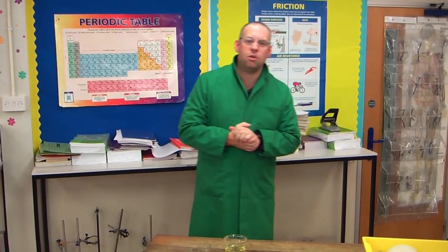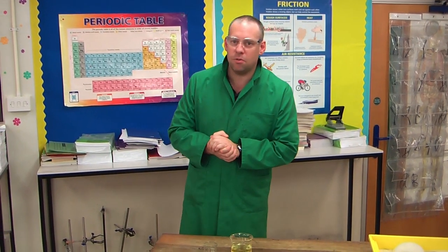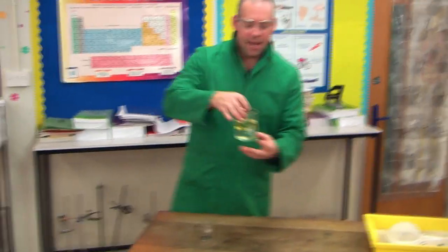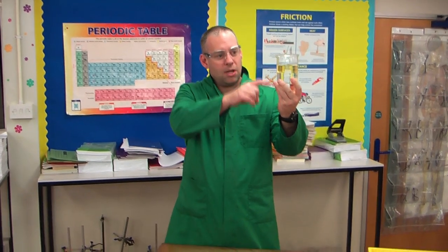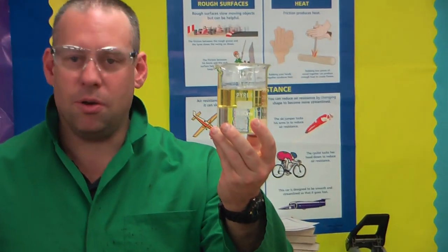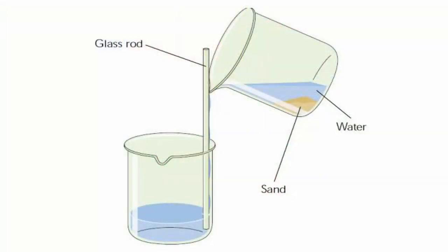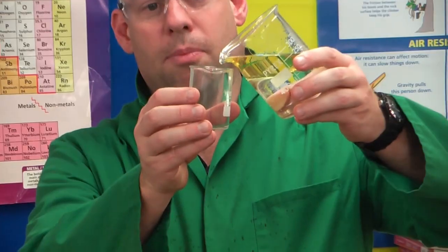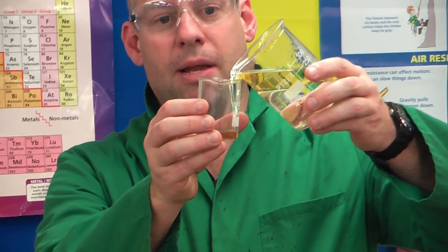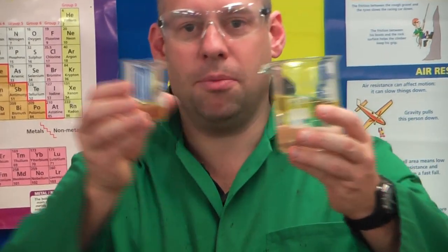So we're going to start off with the first one. Our first method is what we do when we've got two liquids that don't mix. The example I've got for you today is oil and water which you can see forms nice two clear layers here. The oil floats on top, the water at the bottom. So the method for doing this is very simple. It's called decanting. To decant a liquid you just pour off the top layer and the bottom layer remains. I've now separated some of the oil from the water.